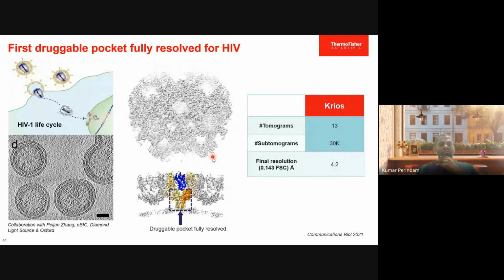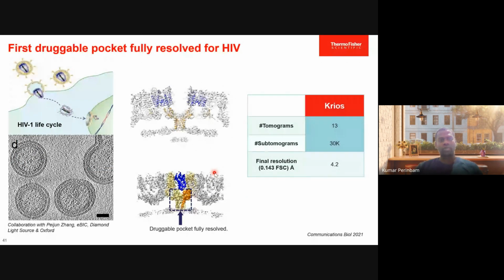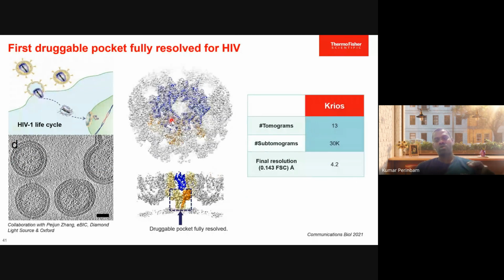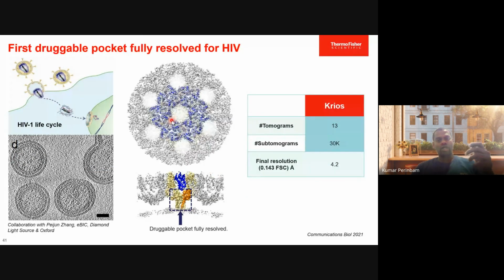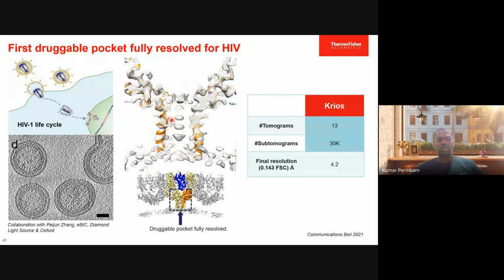Okay, cryotomography is like this. In this case we have used a virus particle, where you can directly put the virus onto the electron microscope and rotate it, and every single protein molecule on the virus can be imaged by tilting.